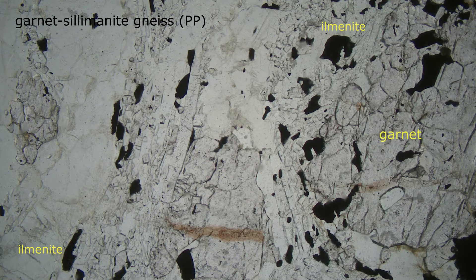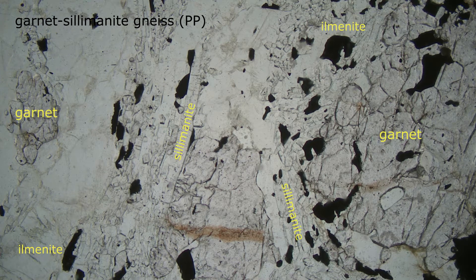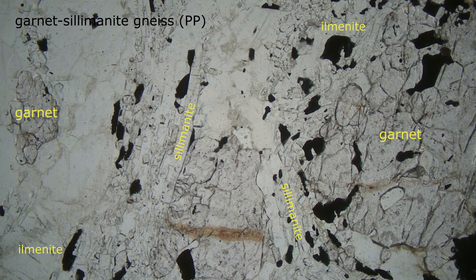The blocky, high-relief grains with many fractures are garnet. And the long needle-like grains are sillimanite. In some places we see end views of sillimanite needles and they appear as small squares or rectangles.